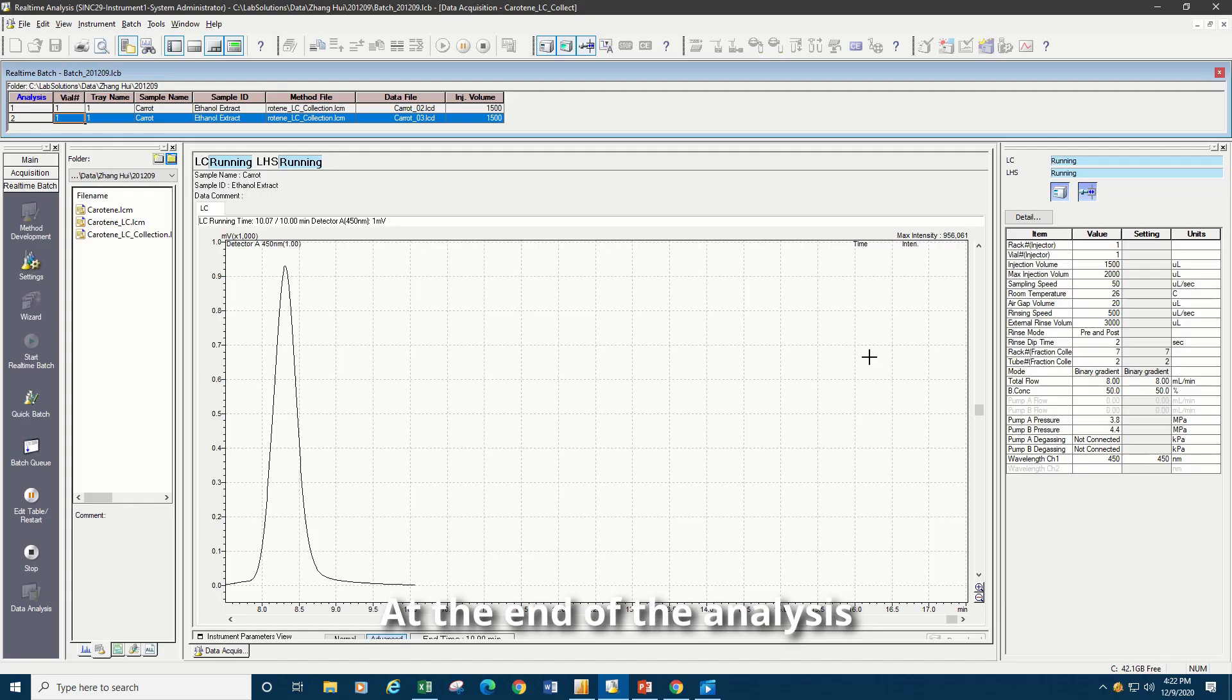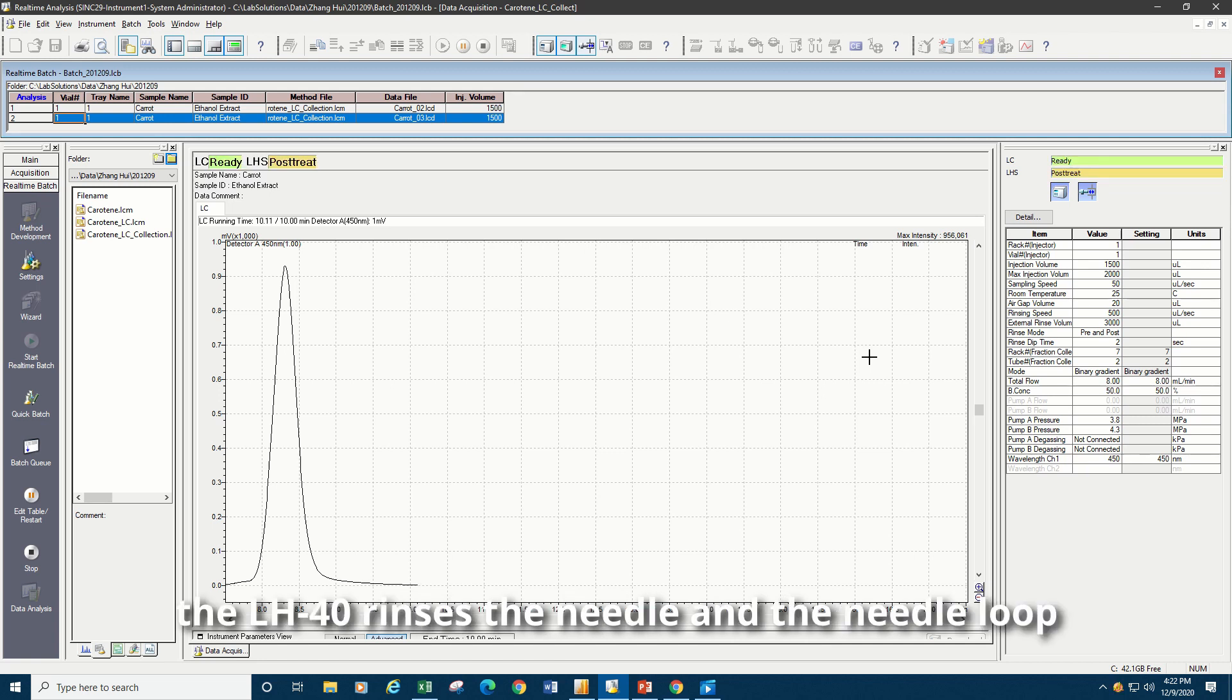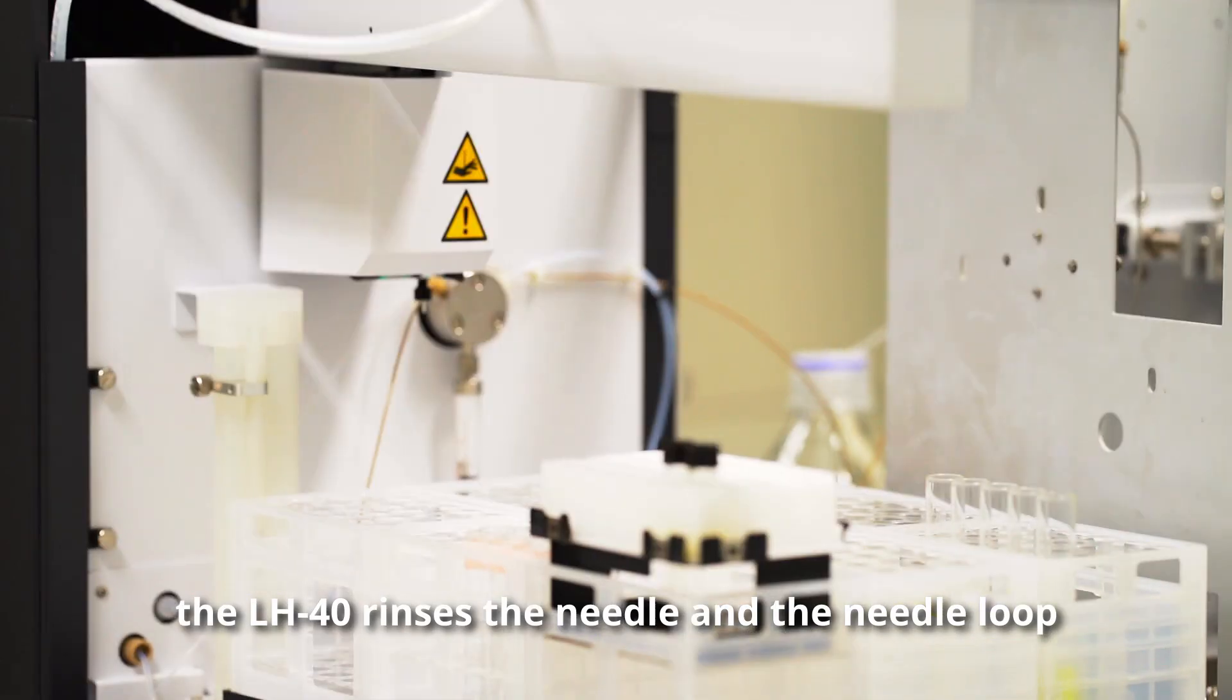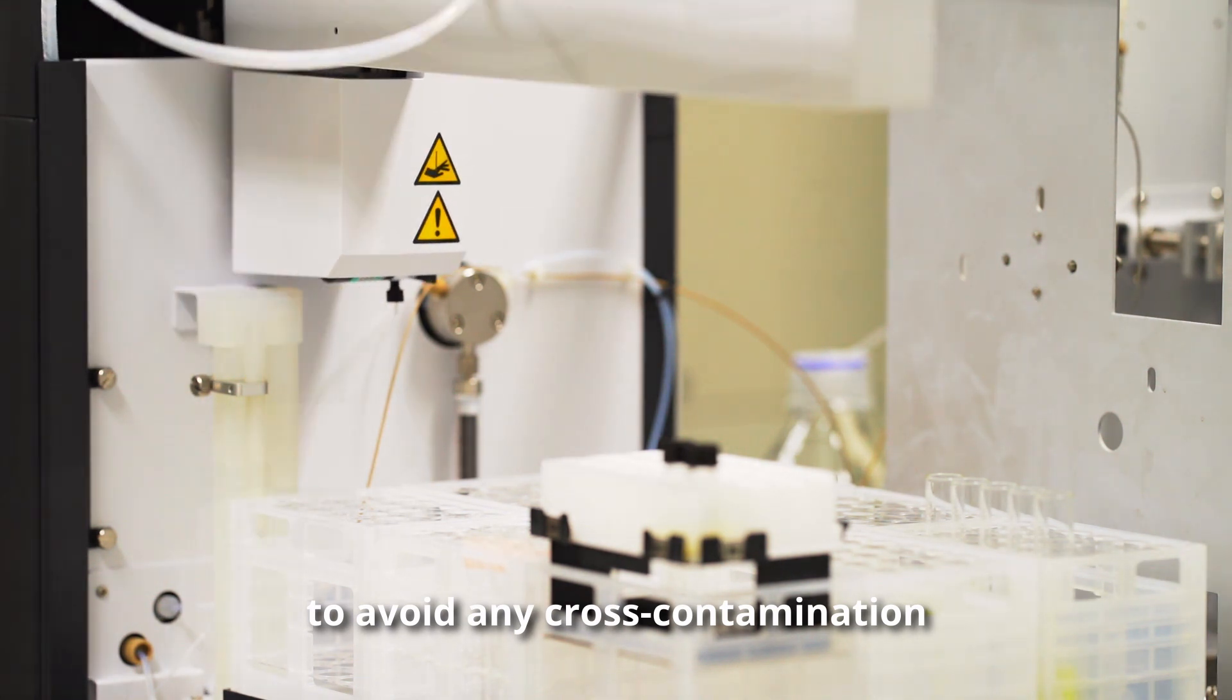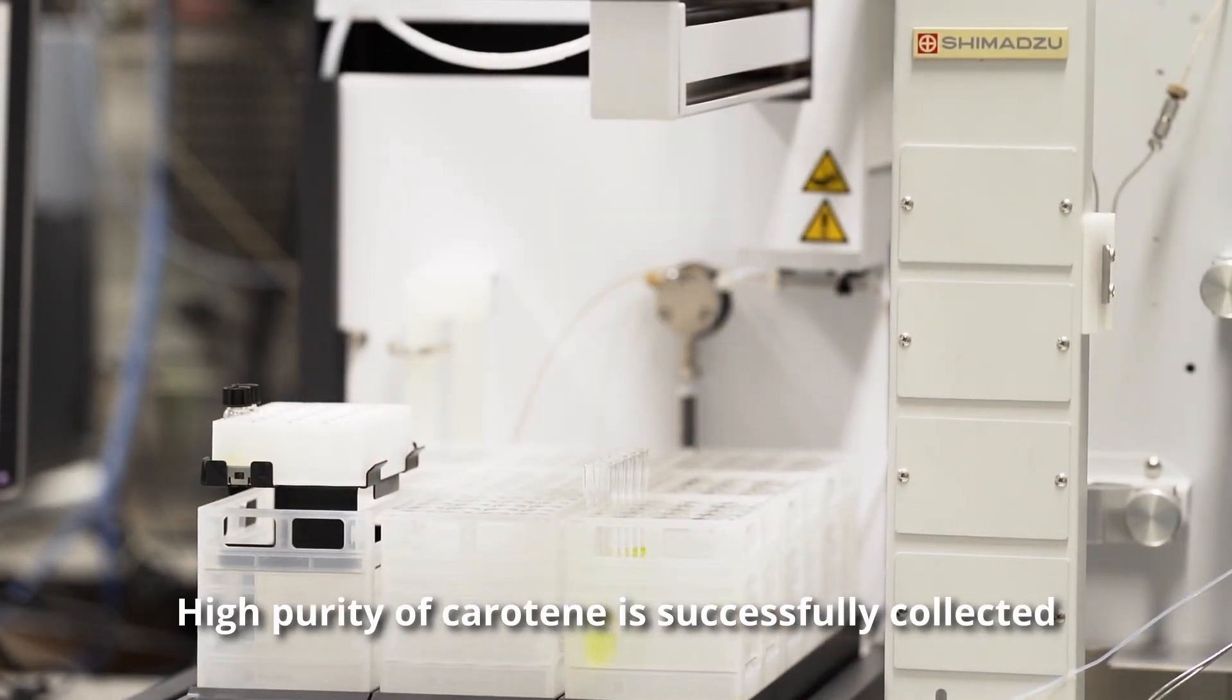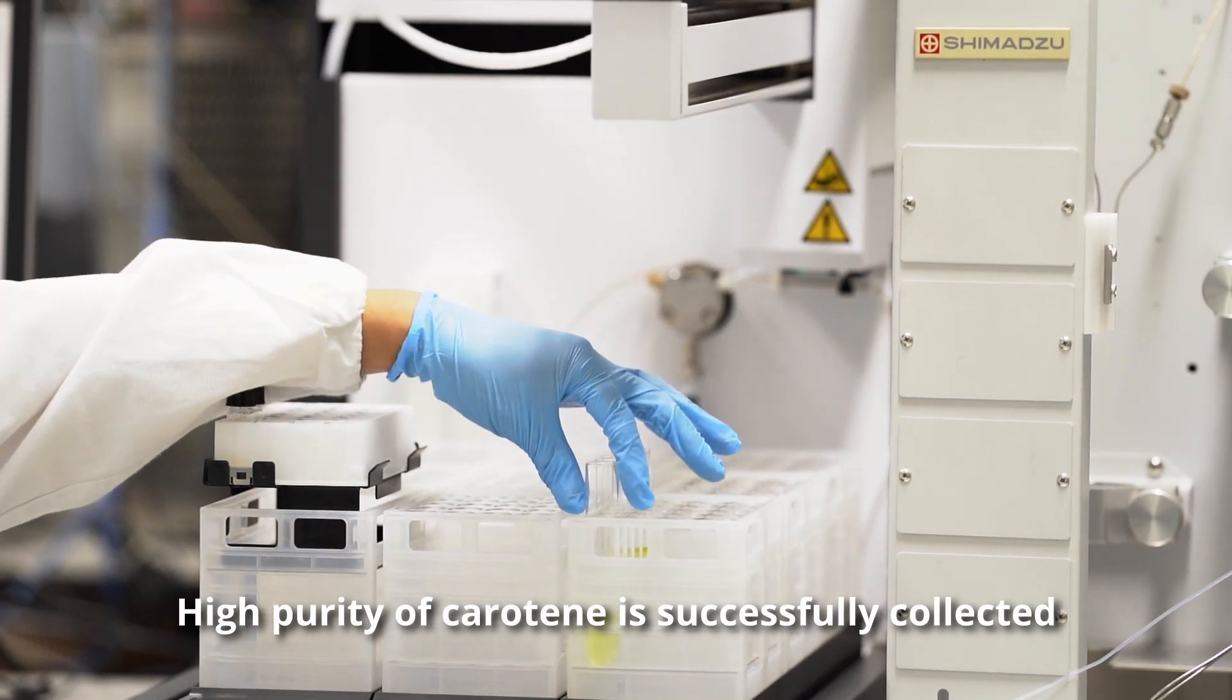At the end of the analysis, the LH40 rinses the needle and the needle loop to avoid any cross-contamination. The high purity of carotene is successfully collected.